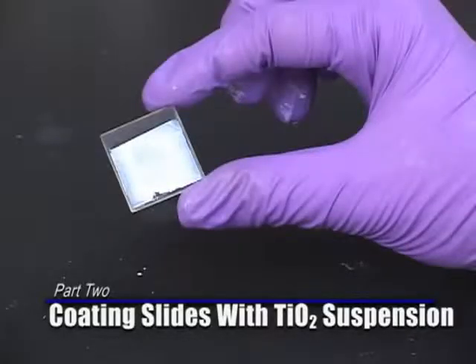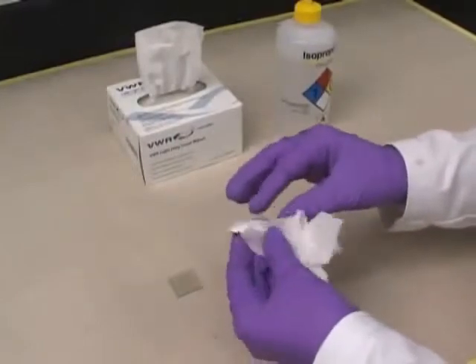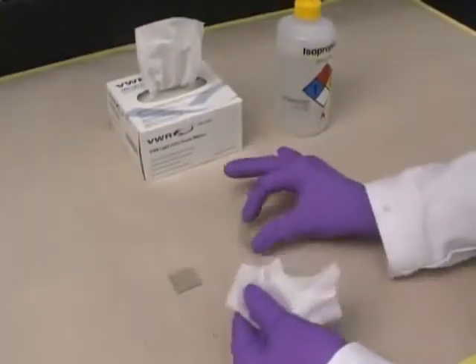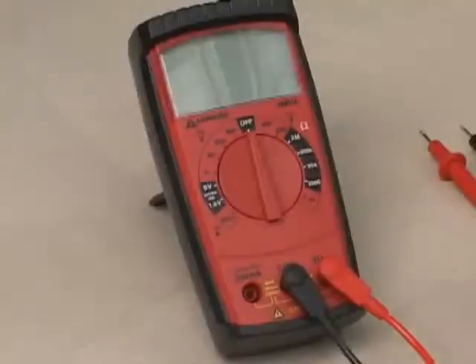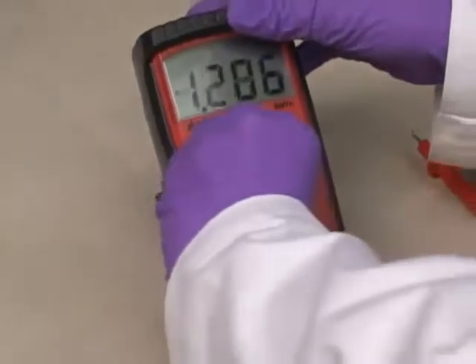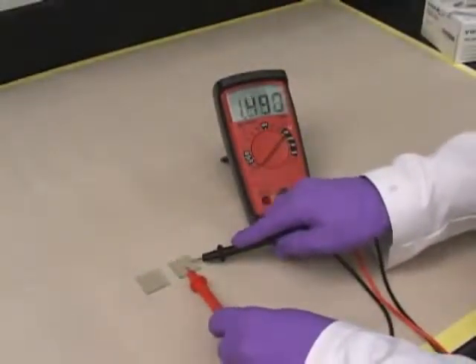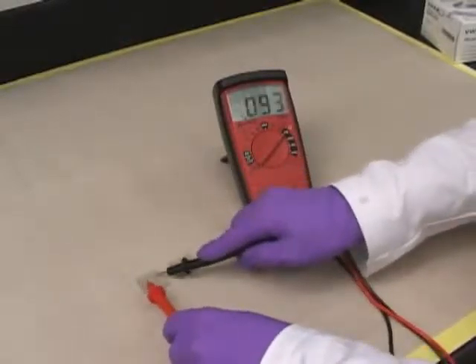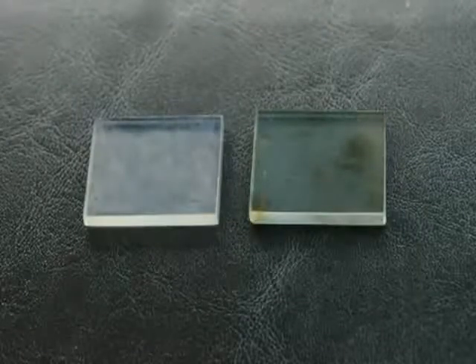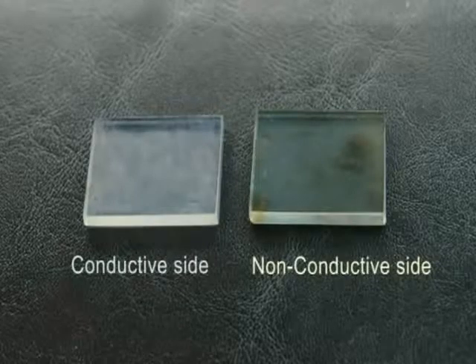Part 2: Coating Slides with a Titanium Dioxide Suspension. Step 1: Clean two conductive glass slides by rinsing them with a wash bottle filled with ethanol. Gently dry them with a soft tissue. Step 2: Use a multimeter set to resistance (ohms) to check which side of the glass slide is conductive. The slide should conduct between 10 and 30 ohms on the conductive side and nothing on the non-conductive side. The conductive side will appear bluish and cloudy, while the non-conductive side will appear clear and yellowish.